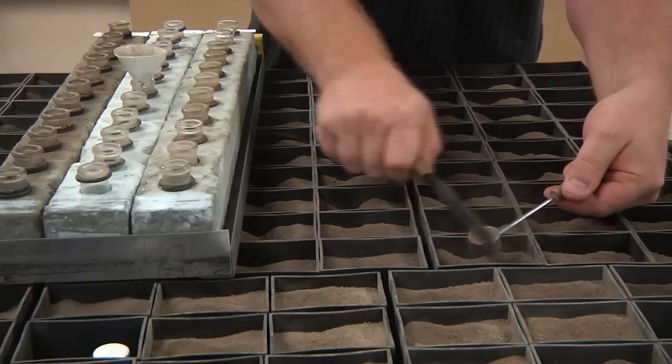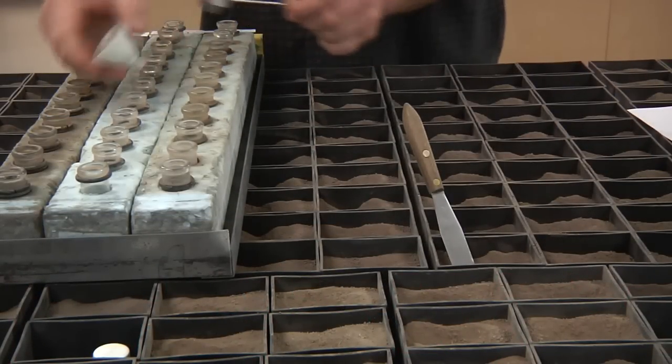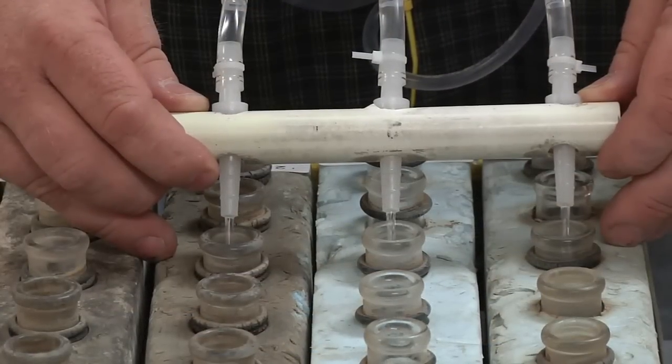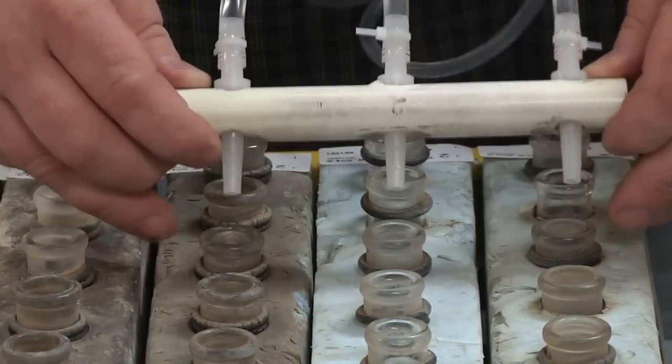When we do soil testing in the lab, the first thing we do is measure an accurate amount of soil and put it into a flask. Then we add extracting solution.